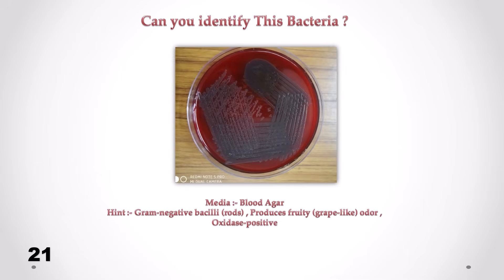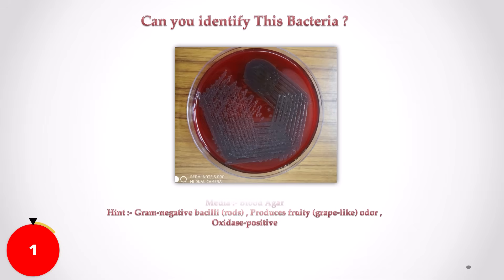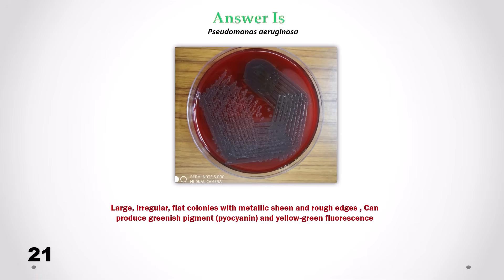Can you identify this bacteria? Correct answer is Pseudomonas aeruginosa. We can see large, irregular, flat colonies with metallic sheen and rough edges. Pseudomonas aeruginosa can produce greenish pigment pyocyanin and yellow-green fluorescence.